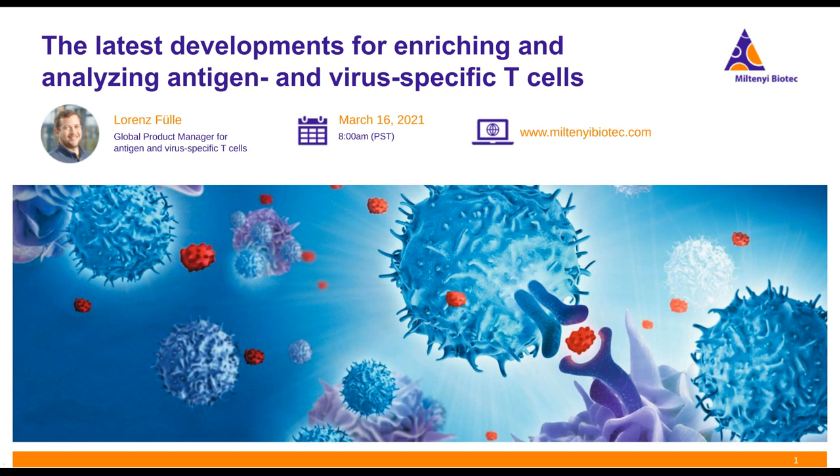So also for CD8, and although this is scientifically not completely known yet how it actually works, if you co-culture T cells and antigen-presenting cells and then spike in the peptivator, the APCs will present the antigen and then activate the CD8 positive T cells as well. And this works very well for intracellular antigens as well.